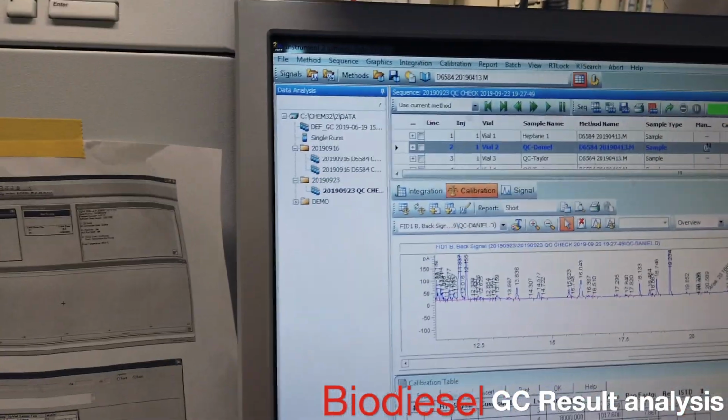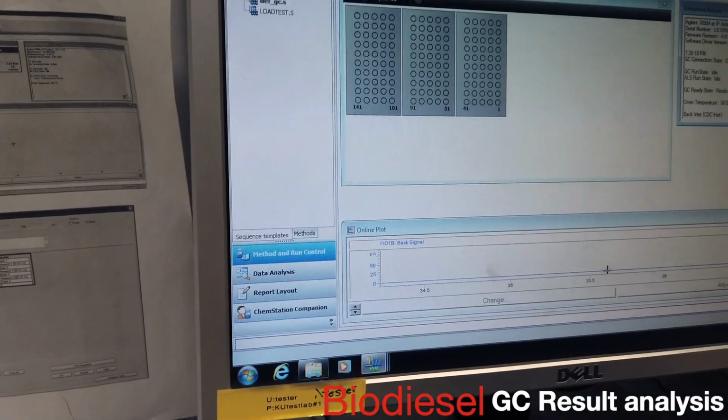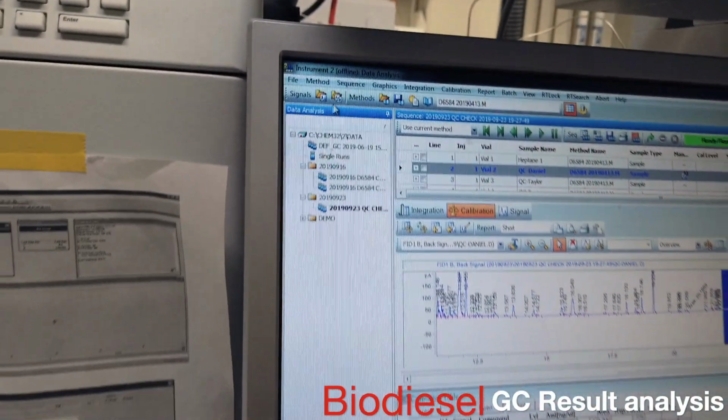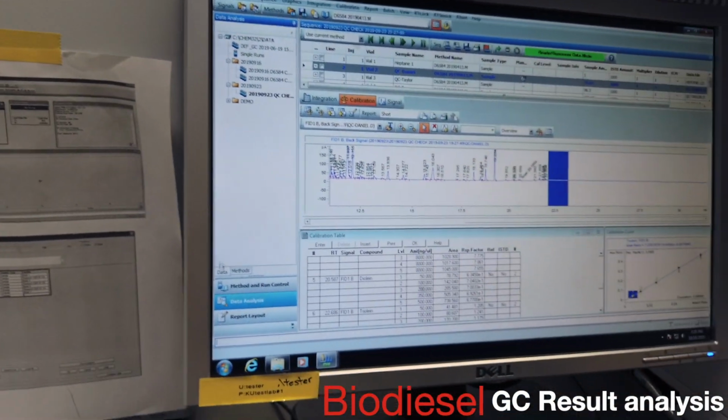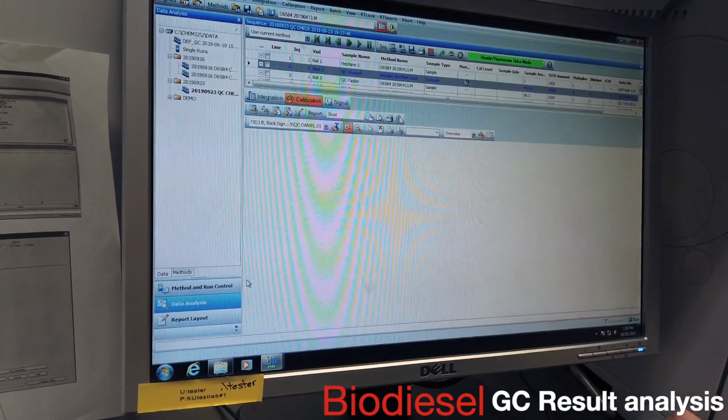Okay, so yeah, method. Actually, wait, let me close this out first. Actually, no, it's on standby. We're fine. Okay, so this is done. Right. So I'm going to go to method and run control.